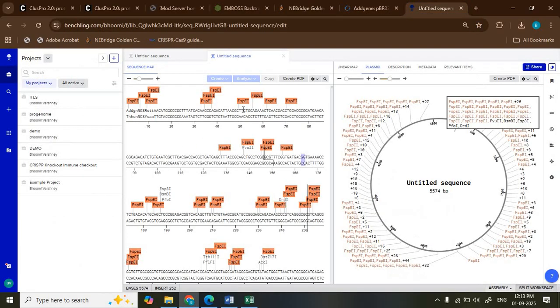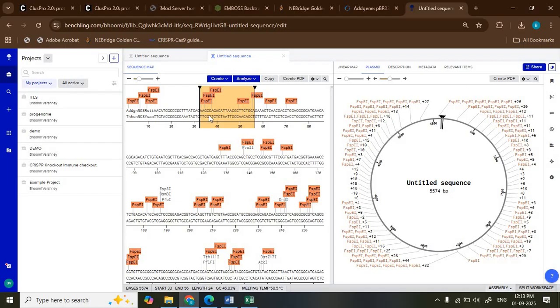By the help of this software you also create annotation, primer, translation, new amino acid sequence, DNA as well, and we analyze in analysis: run Primer3, submit to NCBI for the BLAST, analyze the translation and optimize the codon, like forward and reverse.